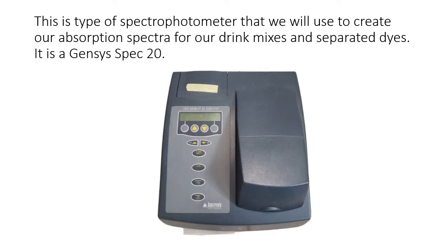Okay, so I'm showing you a picture of the spectrophotometer. Now, I think a good way to look at this particular PowerPoint is to get the actual directions for the lab and follow along using the directions, because it explains certain things that are not there in the directions, and it will help you understand what you're doing while you're doing it. So it goes along with the directions, but it's not explicitly the directions.